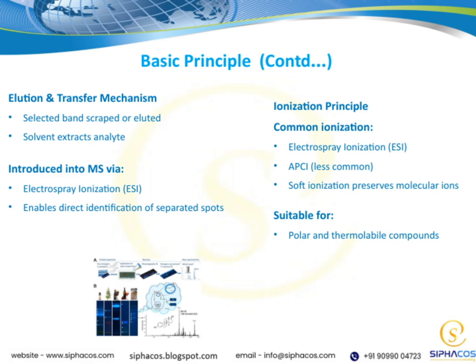Now, moving on to the elution and transfer mechanism. Typically, we select a band, which can either be scraped off or eluted, and then the solvent extracts the analyte from that band.